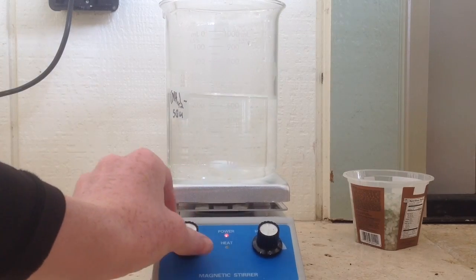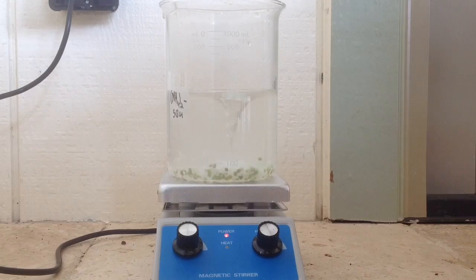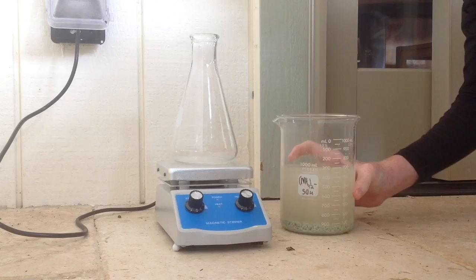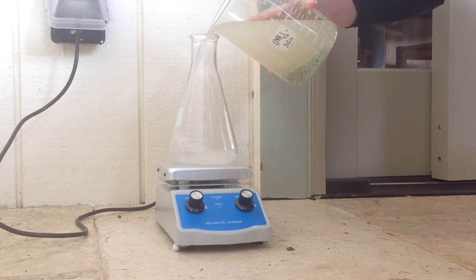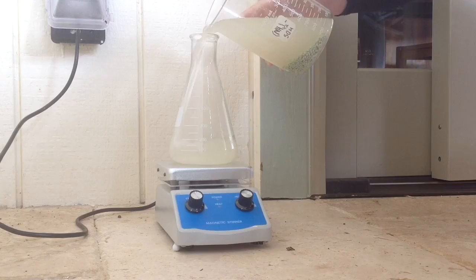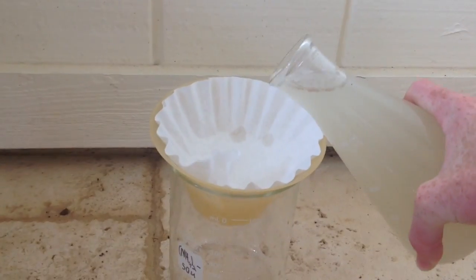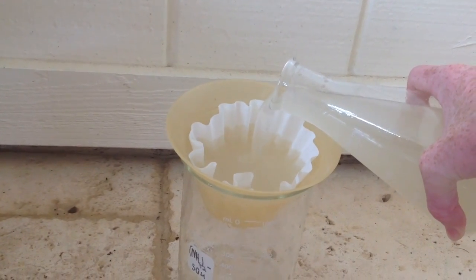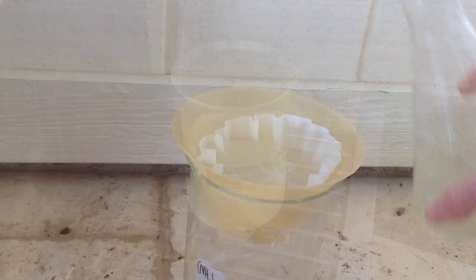Next I simply turned on my stirrer and added the fertilizer. I dissolved the fertilizer until only green beads were left. An intermediate step that I did was decanting the liquid so that I didn't have to deal with all the green beads in my filter. Next, I got out my gravity filter and filtered out what might be binders, dirt, and colorants.